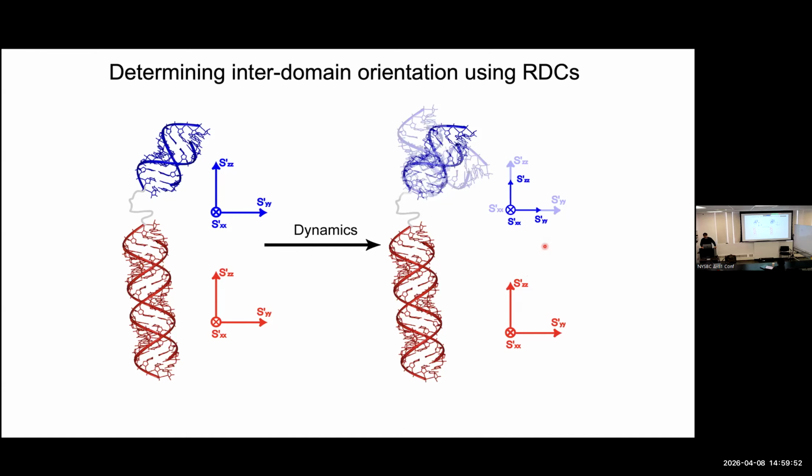But why is the blue helix less aligned? When I have two domains moving, I could say the red is moving relative to the blue. So why isn't it that the red helix is less aligned? Why is the red one dominant? Because it's more anisotropic.